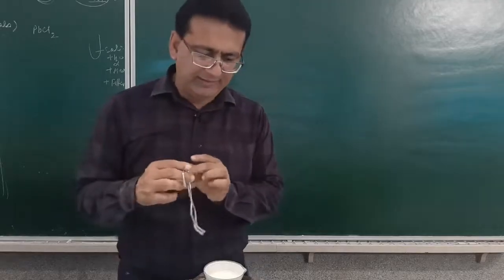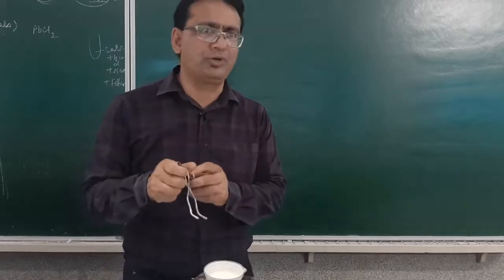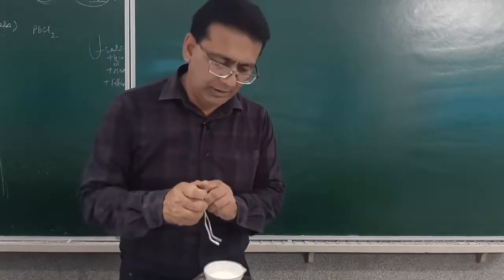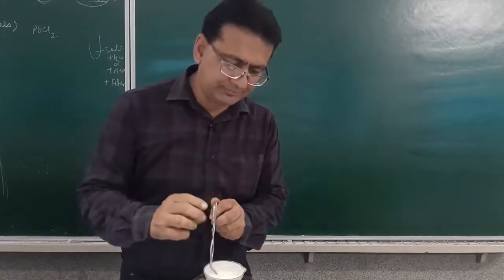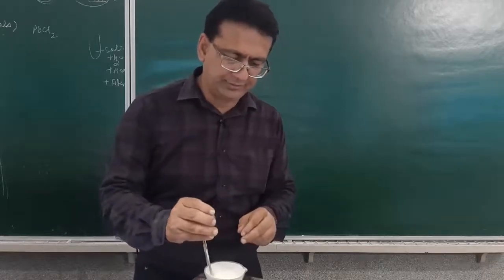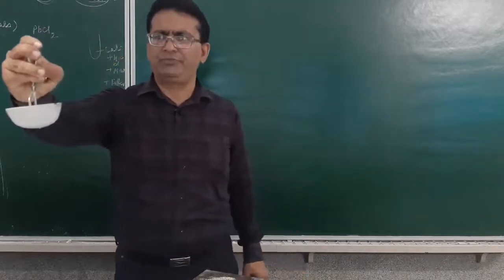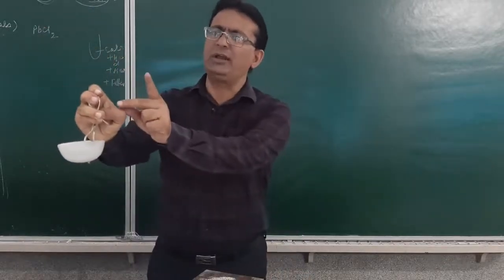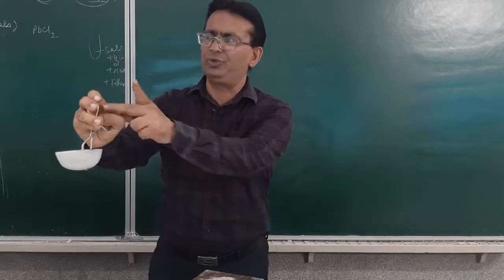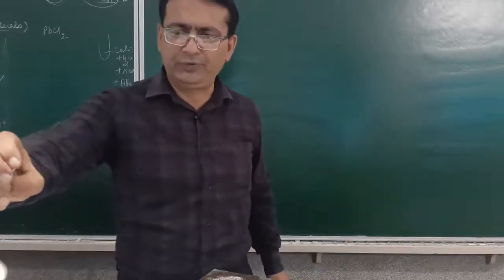You will be 100% safe. But the best safety is precaution. So you have to take all the precautions so that you do not get burned. Hold it tight so that it does not spill. Instead of introducing these fingers into the spatula, I suggest you hold it from the outside. Am I clear? And then you start filtering.